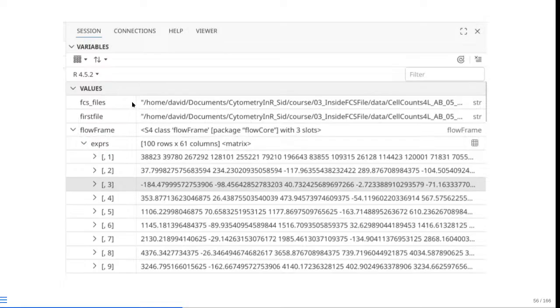So you can see everything within the first values column. It's showing up as square brackets, comma 1, comma 2, comma 3, increasing numbers as you descend. And then you see values that are present within the actual row. If you actually were trying to match what these are, you would see eventually it does seem to correspond to the actual values for each column that are present for a particular row, but definitely not friendly, definitely not something I would want to be interacting with directly.